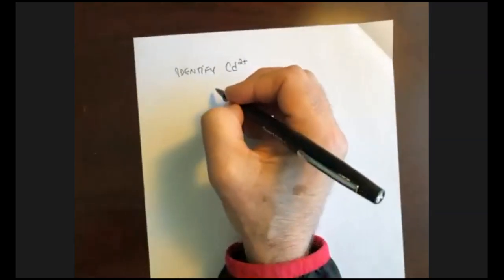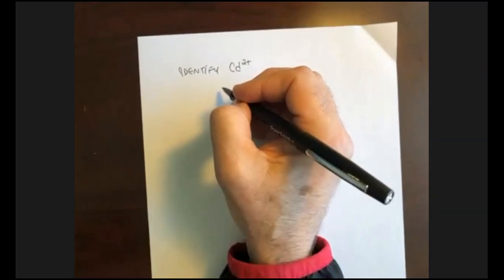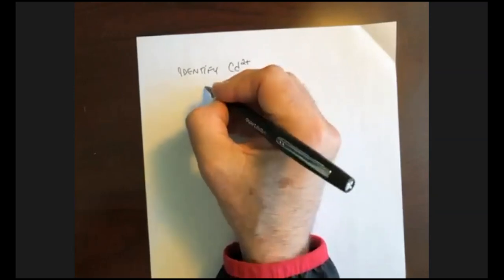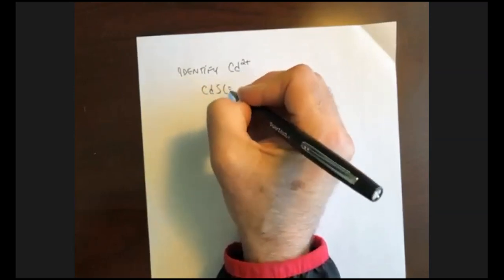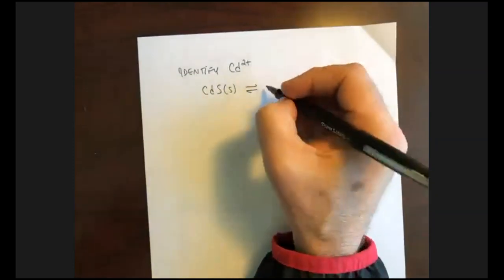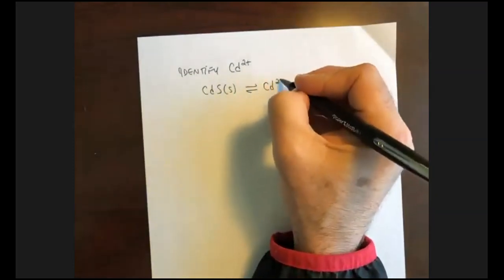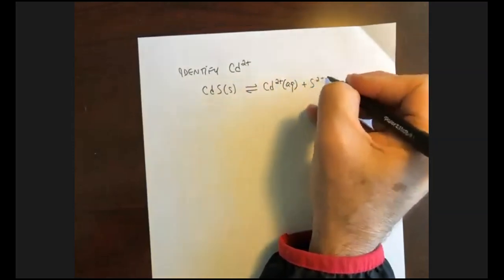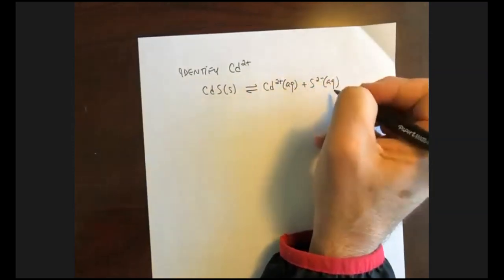Remember, as we've mentioned before, but as we'll study in other chapters, the cadmium sulfide is always going to be in a small equilibrium with the actually dissolved ionic forms here, right? These are the ions.